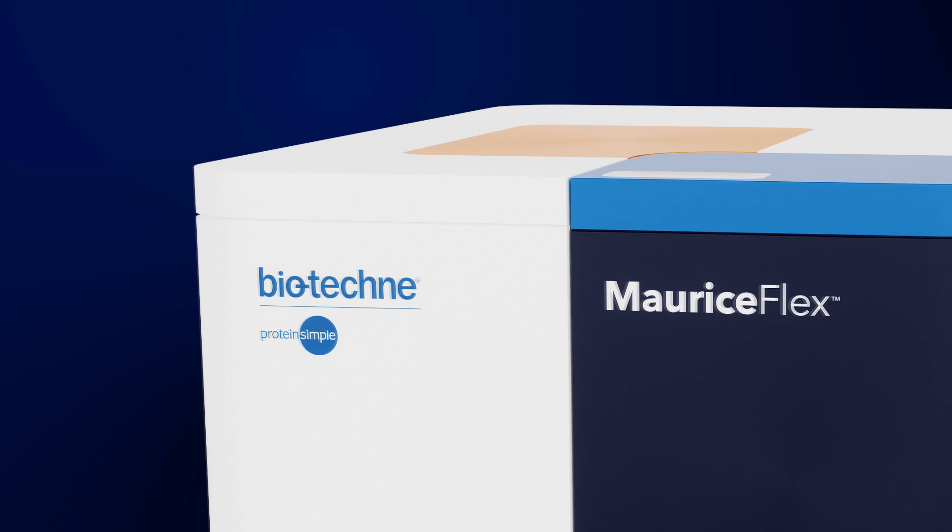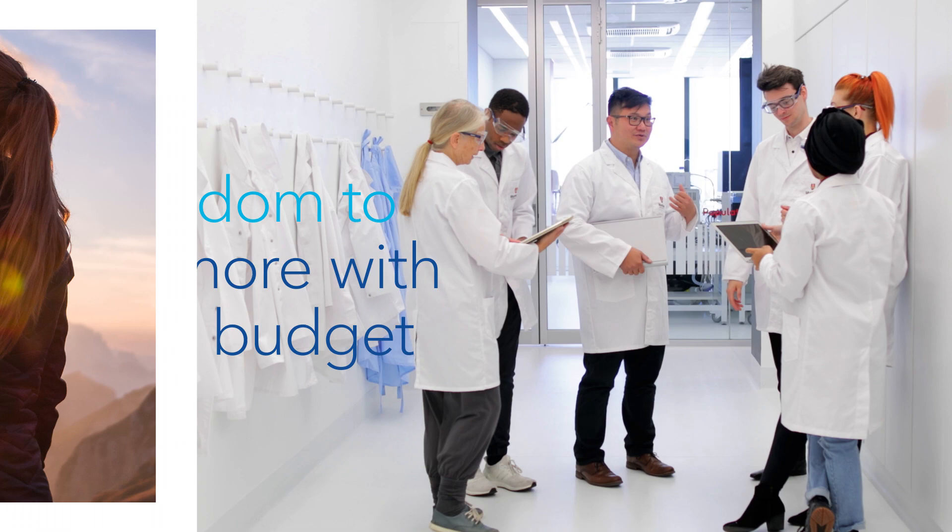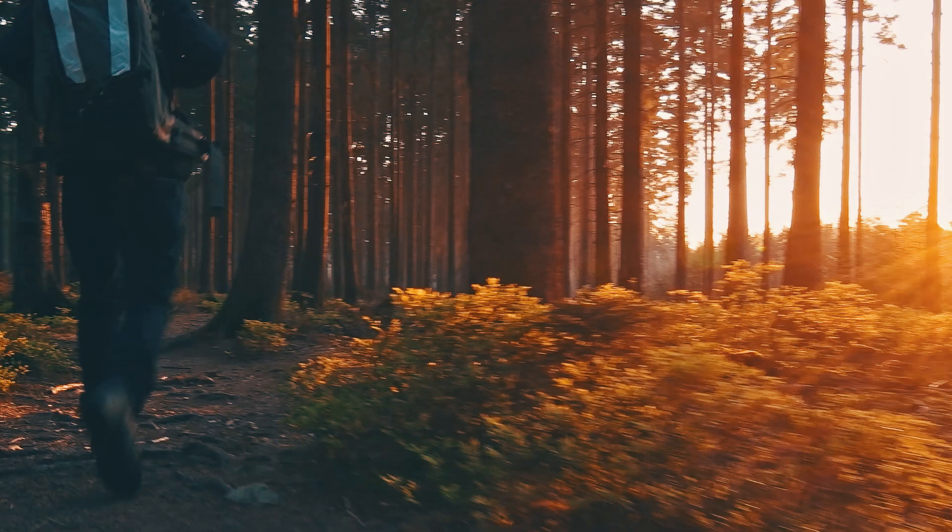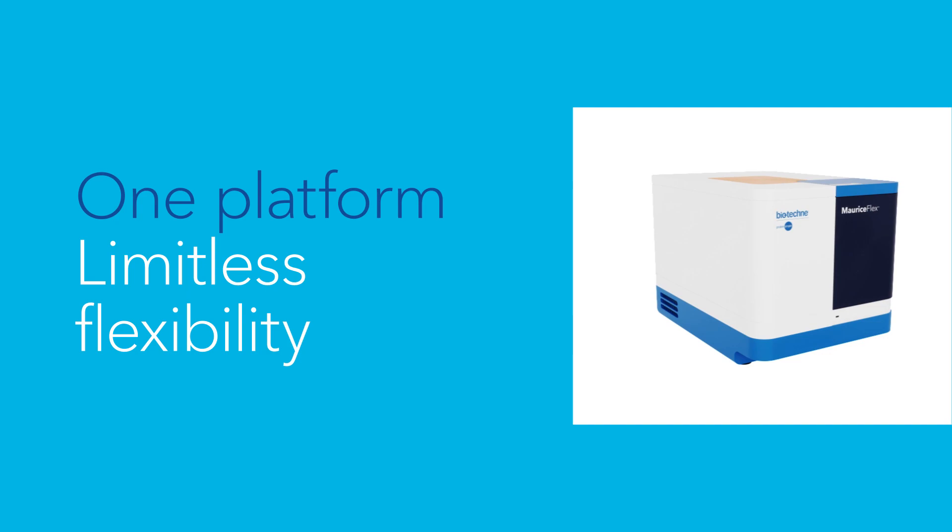MauriceFlex does it all. Collect charge fractions of your samples, even those with excipients not compatible with mass spec, such as urea and methylcellulose, and run routine ICIEF and CESDS assays. You get it all on one platform and one software. Save on time, money and bench space.